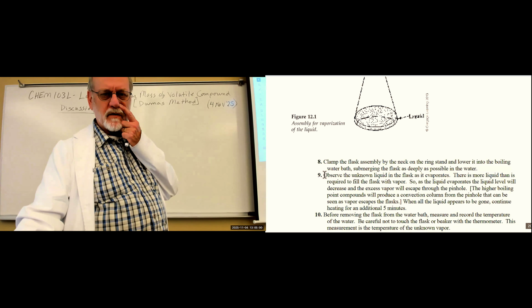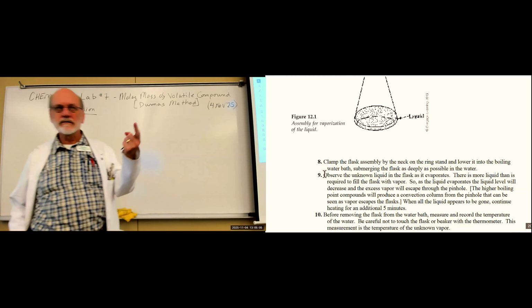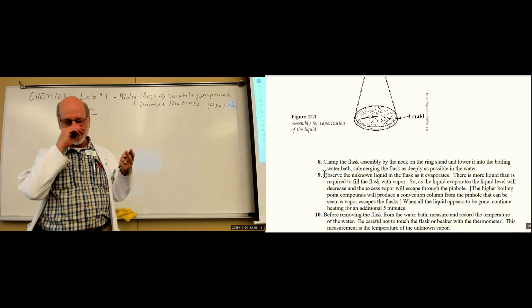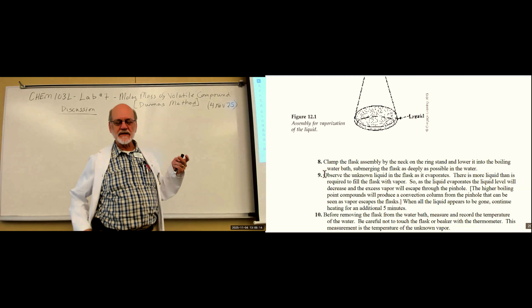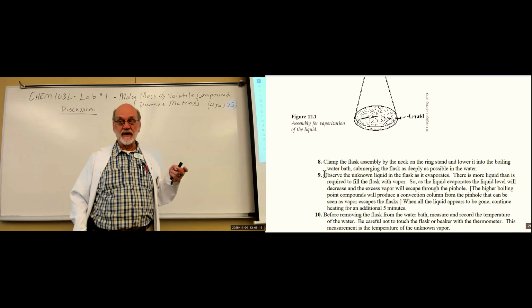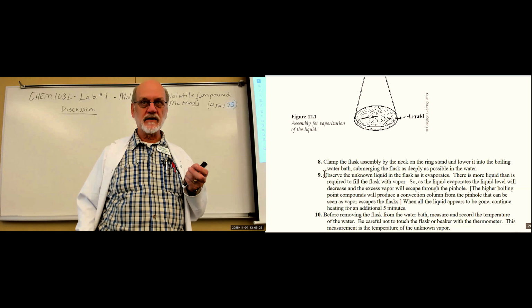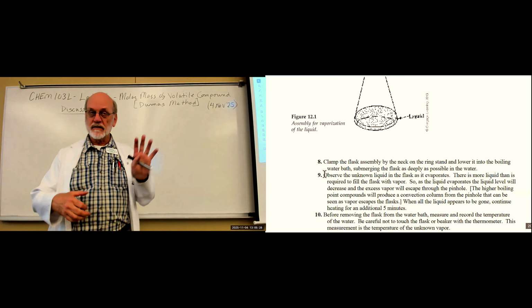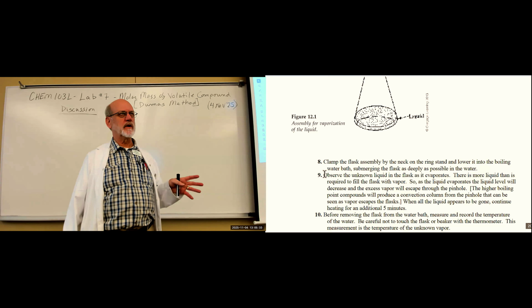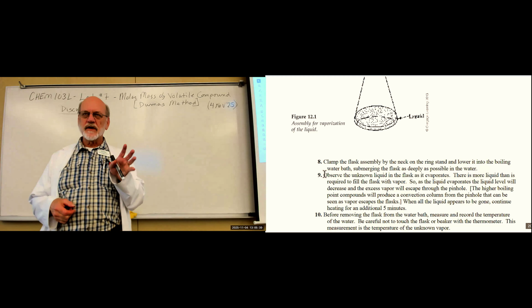So let me see. What about safety hazards? Glassware? Boiling water. Oh, yeah. And there's a hot plate there too. How about these compounds? I told you they're all organic compounds. They're flammable. You don't want any open flames around them, especially in the gas phase. Because I'm sure they've reached their, let's see, what's the proper term? Not flash point, but it's the concentration at which they will combust.